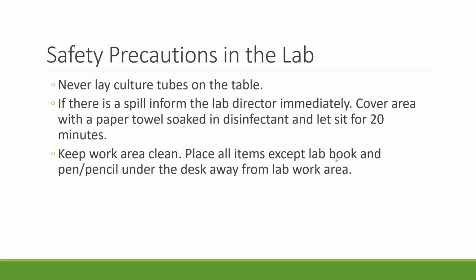The other thing about the lab is I'm always very cautious with students to keep their work area clean. If you walk into a lab and it's a wet lab and I'm teaching it, everybody has to put book bags up, any extra clothing up. There are no cell phones, keys, etc. on your work area, because we're about to put microbes over there. Anything that touches that workbench has the potential of becoming contaminated.